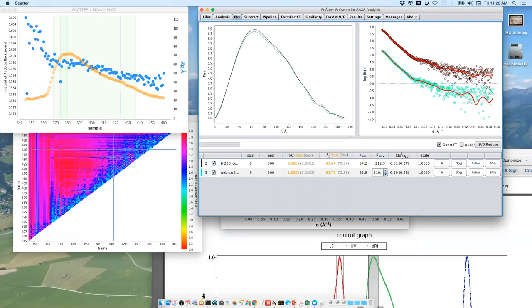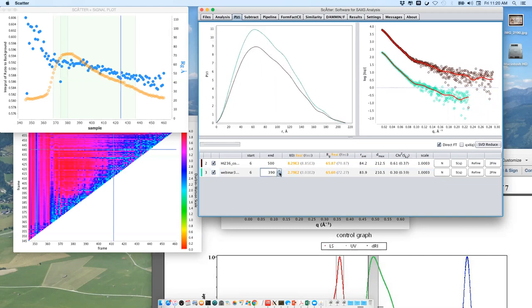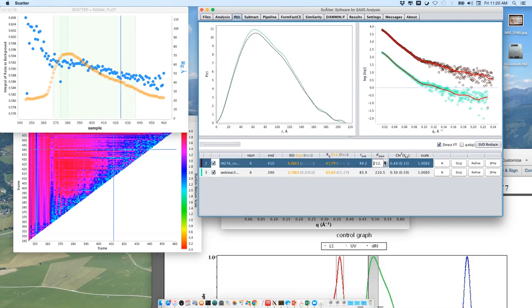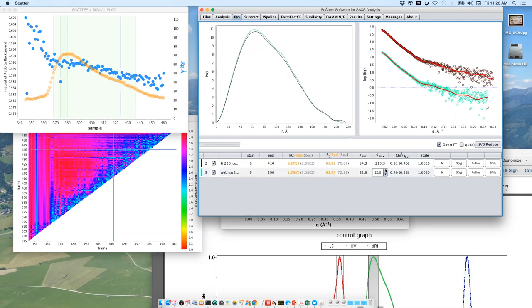Yeah, in general, you see that the Fourier transformation really is not capable of fitting this data here at high Q, because the noise is bigger than for the deconvoluted curve. So in this case, you need to cut the data more and get an idea about how helpful the scattering profiles really are. So those are very useful tools. You can use them also for monomer-dimer mixtures.